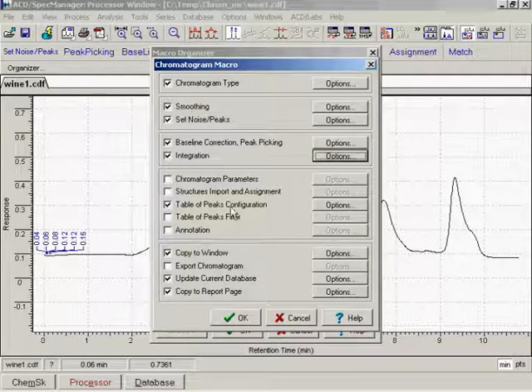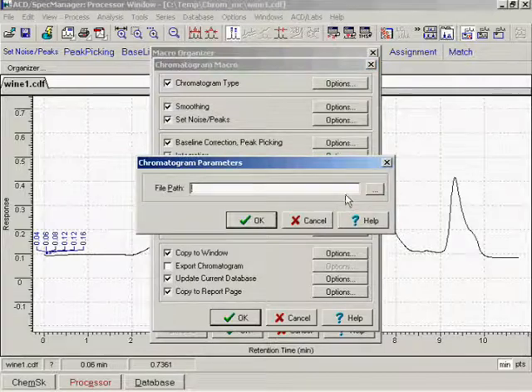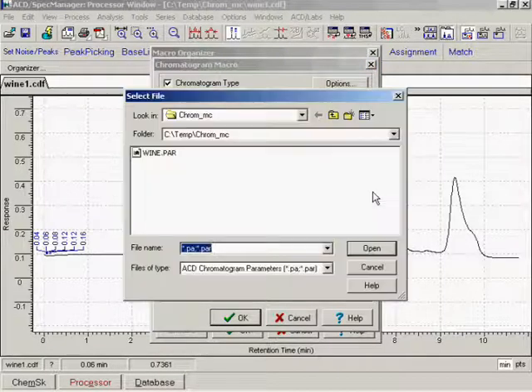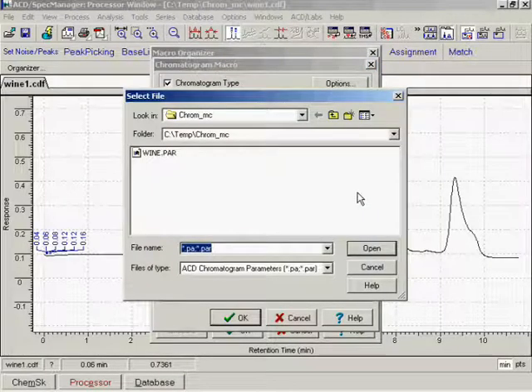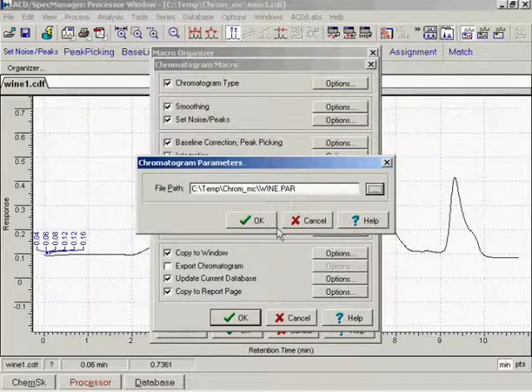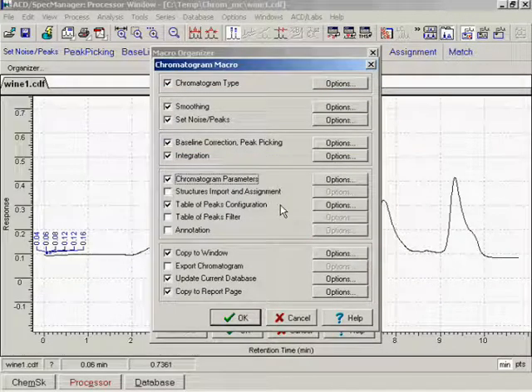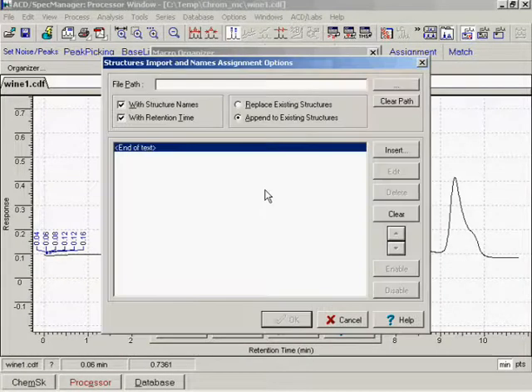Indicate the location of a file from which HPLC parameters will be taken. Specify the file from which the structures will be assigned to the chromatogram.